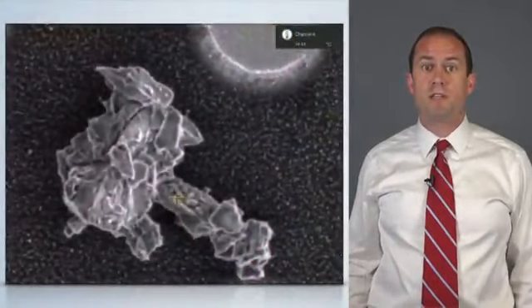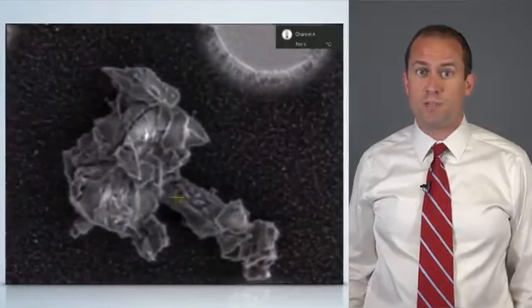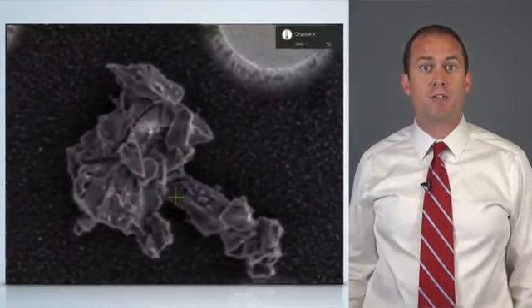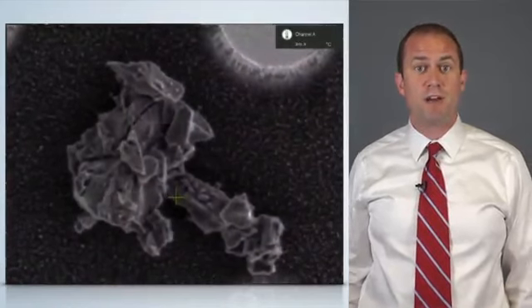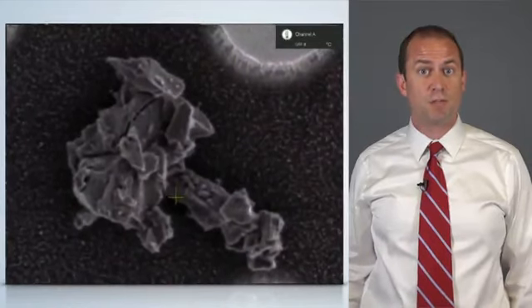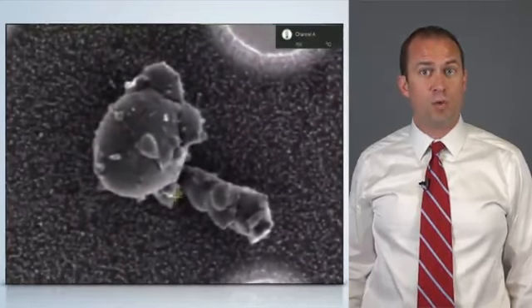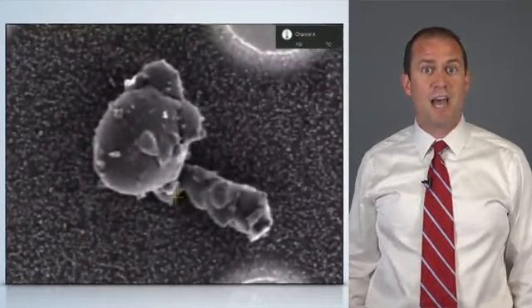For instance, in this video, we see a live SEM feed of a piece of glass frit on a special stage that can heat up to very high temperatures within the microscope. Once the glass heats up to its melting point, we can see how the particle changes as a result of the temperature change.